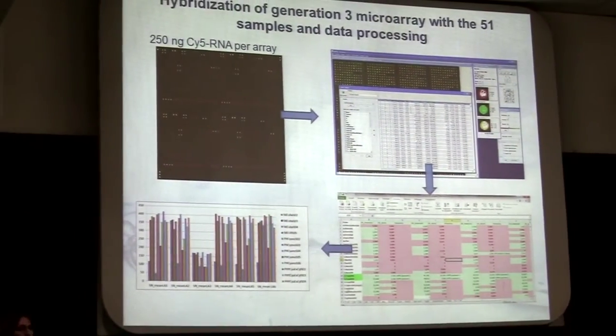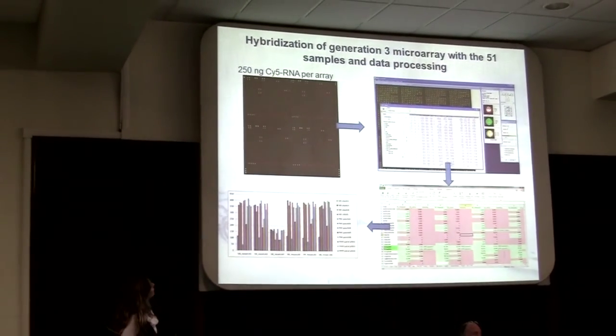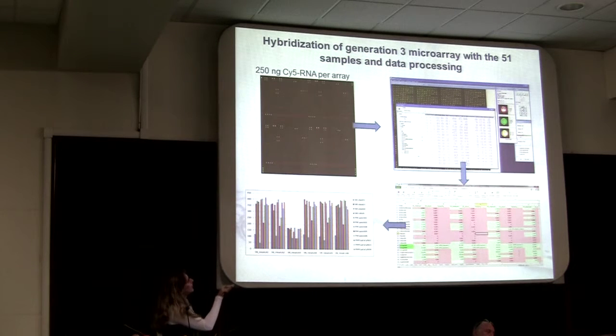We used the RNA that we fluorescently labeled with the Cy5 fluorophore. We analyzed the result like Dr. Weigel told you, and then we obtained data of the fluorescence signal and transformed the fluorescence signals into a graph to compare all the samples together.